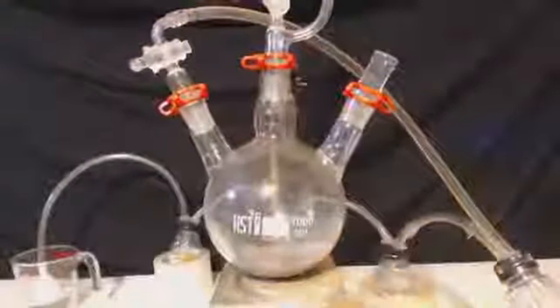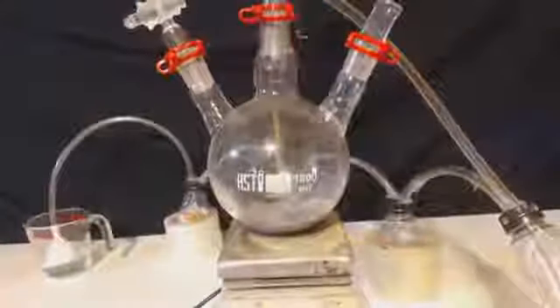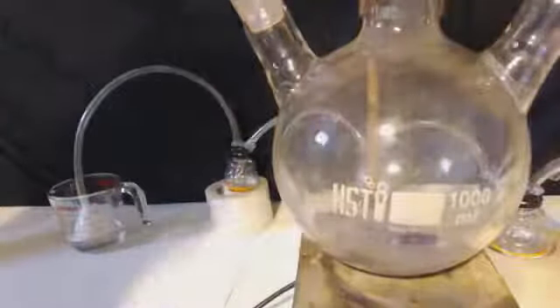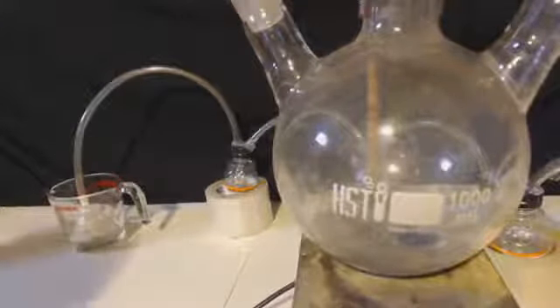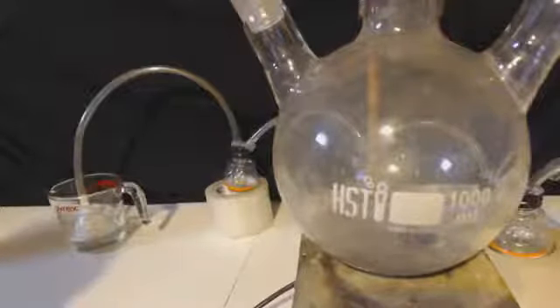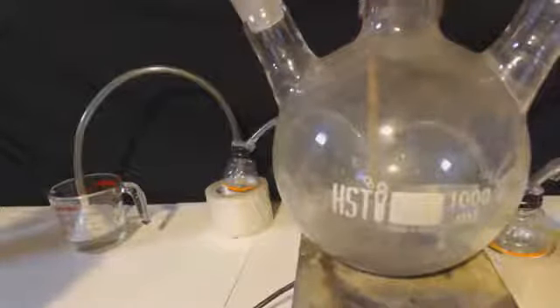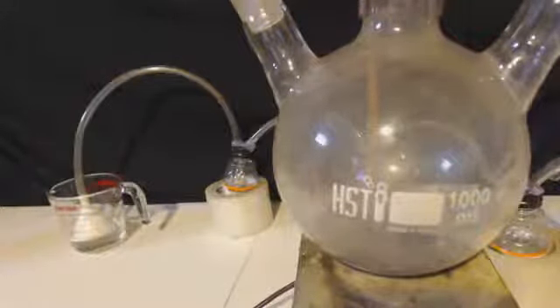As you see, I've got the metal down at the bottom, and there's my tube there. I'm going to start dripping it in. That's actually probably dripping too much. I really can't start the stir bar yet, although I think I do have it started up. It's just wiggling back and forth because it's basically all that metal dust and no liquid.